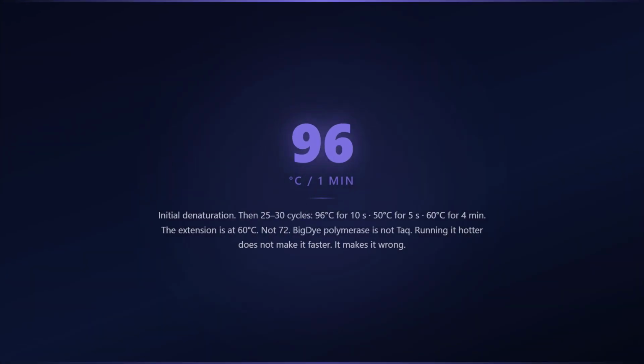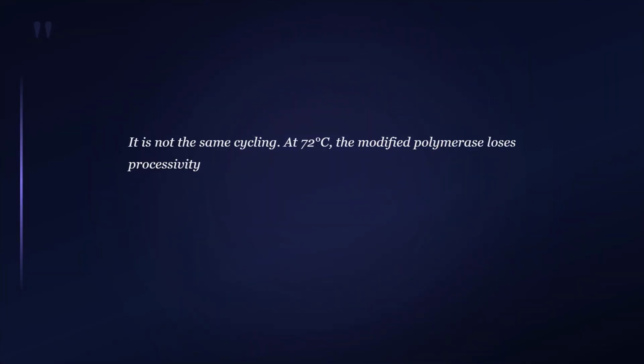Mine is set to 72. I used the PCR preset on the thermocycler. You ran a Sanger reaction on a PCR program. It's the same cycling. I was saving setup time. It is not the same cycling.